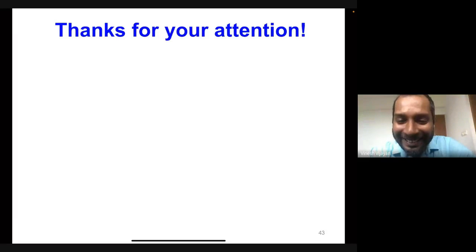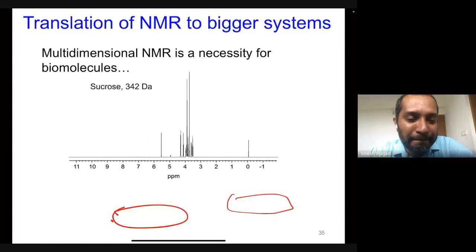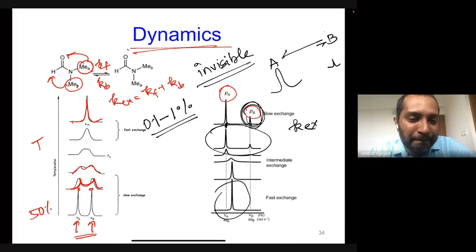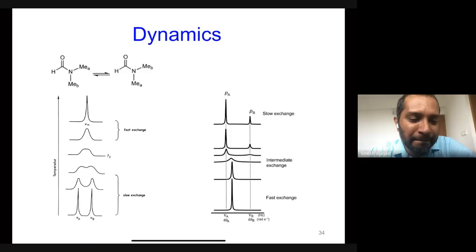This is a fantastic question. This is, I should say, one of the foremost reasons people who do NMR love doing it. So let me go back to this. Unfortunately, I didn't have enough time to discuss it. Yes, you're totally correct. This could end up happening exactly because of the doubling of the peaks that you end up getting here.